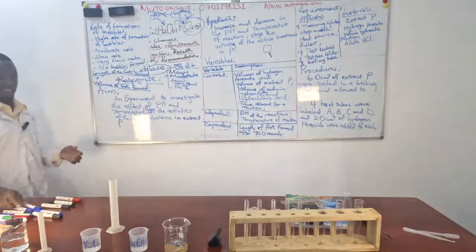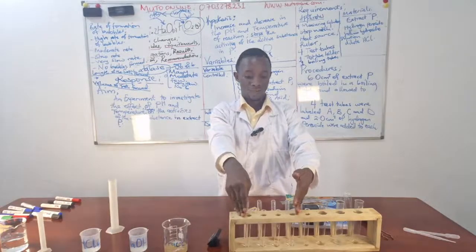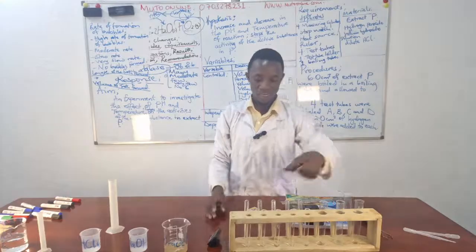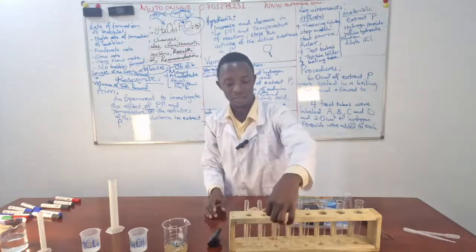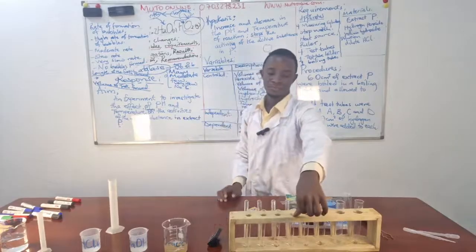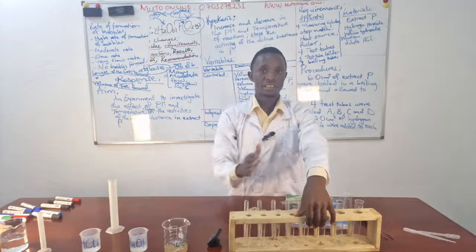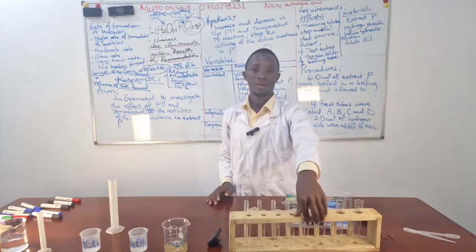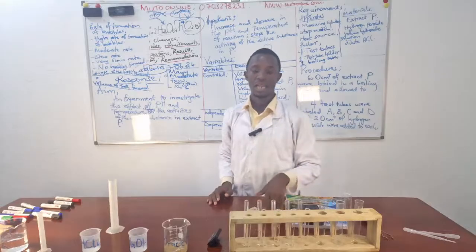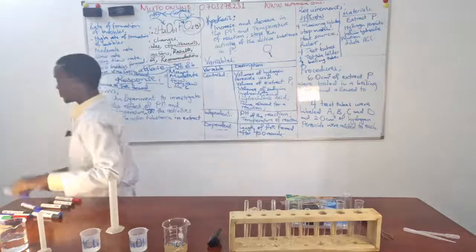We are now writing. What I did is what I'm now writing. So I have 4 test tubes. This is my A, B, C, and D. So in order, this is my A, B, C, and D. I'm not going to use the label slips now. I already have the labels on my rack. So I'm naming them in their order.